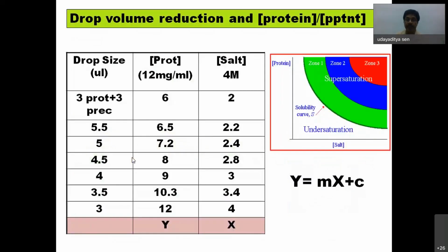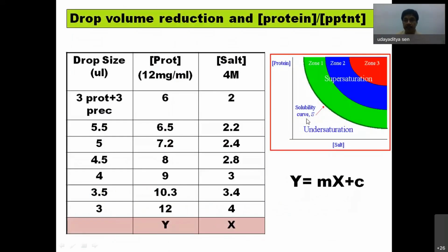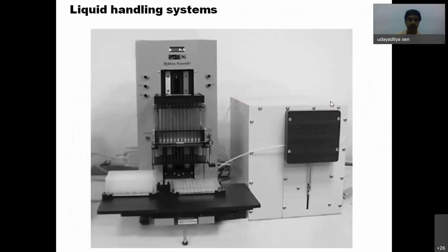If I am here, say somewhere here, in this region, no spontaneous nucleation occurs, and even if the solution is saturated, you won't get crystal. But if from outside you supply some microcrystal or something, then that crystal can grow. This is the situation that occurred over here.